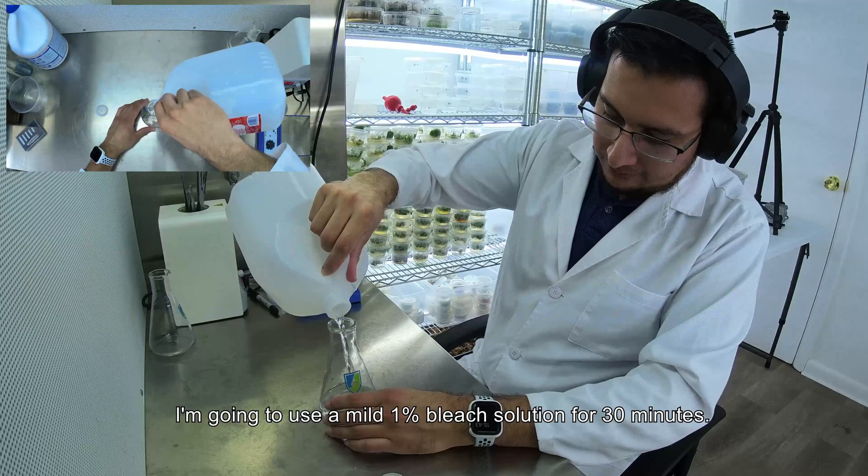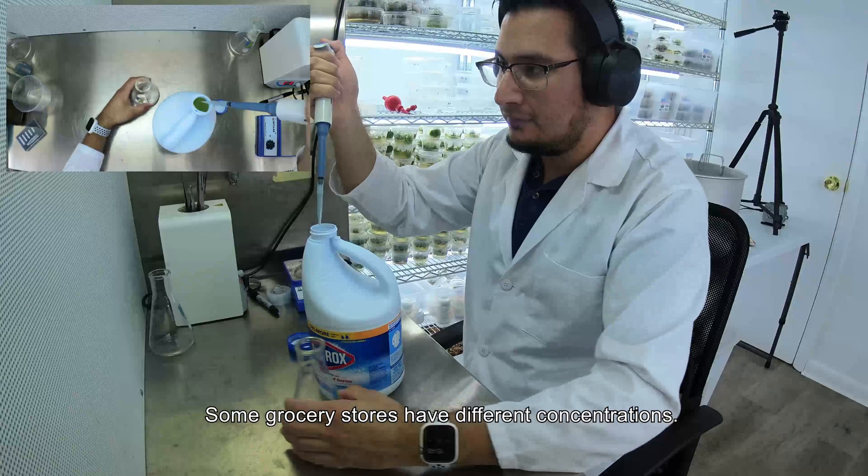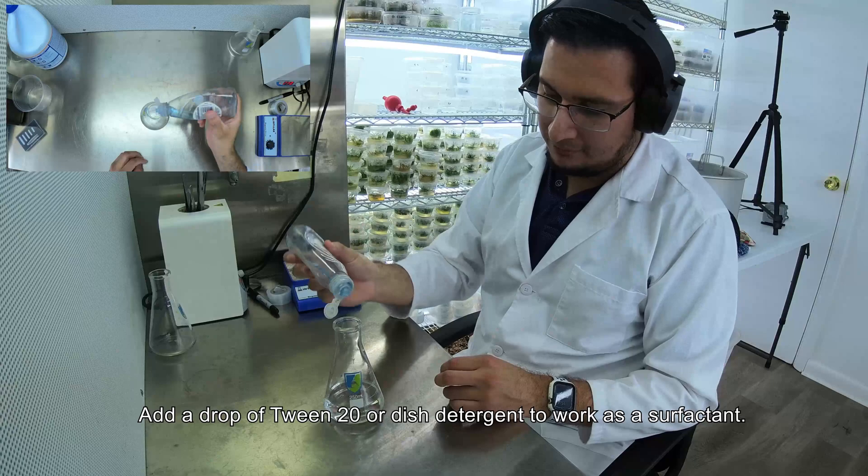I'm going to use a 1% bleach solution for 30 minutes. To 100ml of sterile water, add 1ml of household bleach. The bleach I use is 7.5% sodium hypochlorite — some grocery stores still have different concentrations so make sure to check the label. Add a drop of Tween 20 or dish detergent to work as a surfactant.